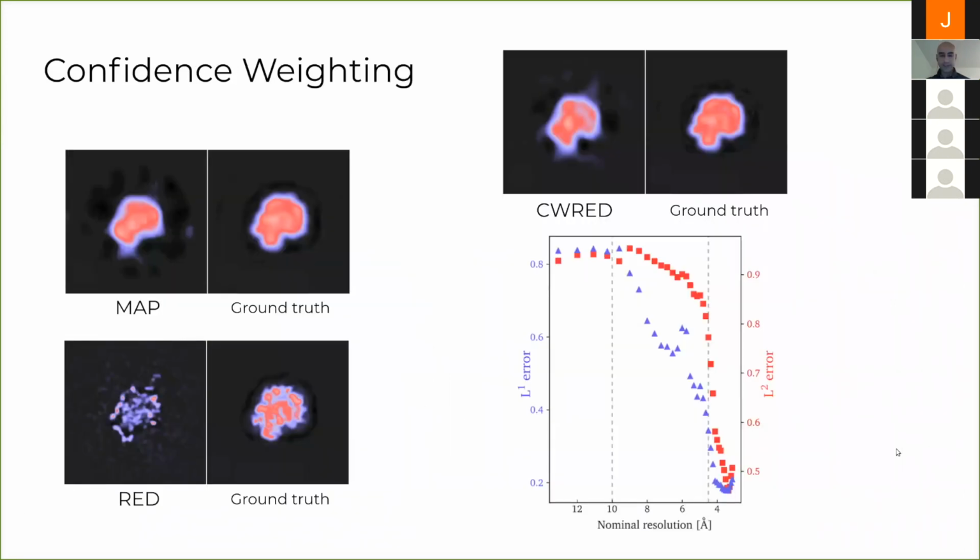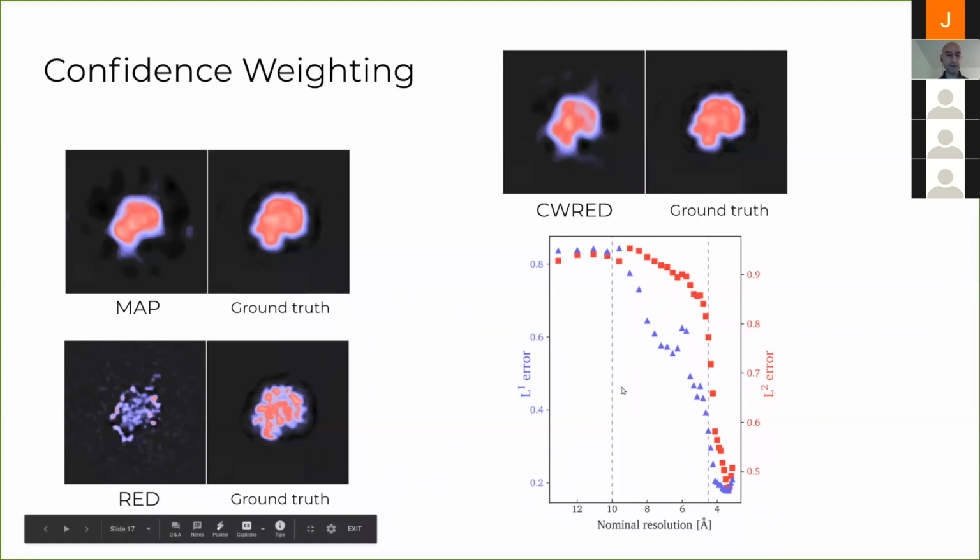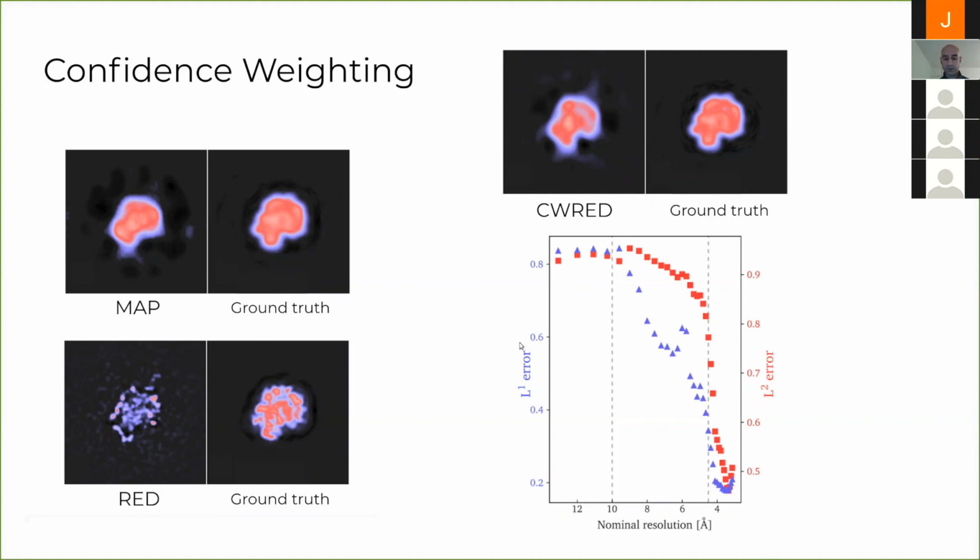Now, we did have an issue because these are, in a sense, generative approaches. We're trying to introduce prior information into our reconstruction. There is always a concern that you're introducing something that's not really there. We did encounter that issue for the really, really most difficult cases.